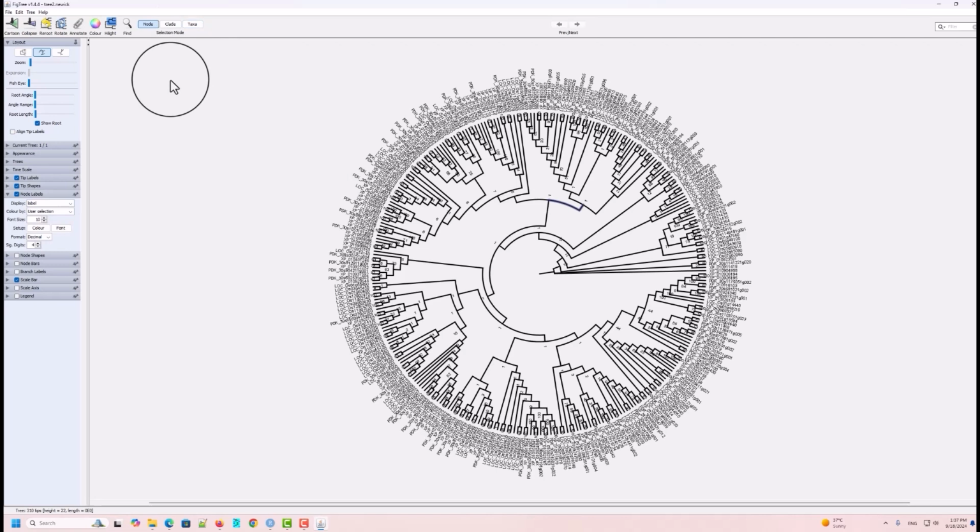So here is the cartoon. Why do we use this cartoon? Because when you have a bigger tree and you want to display the whole tree on one page to the reviewers and the readers, you can collapse different branches, multiple taxa, into a single group. Okay, how can we do this?